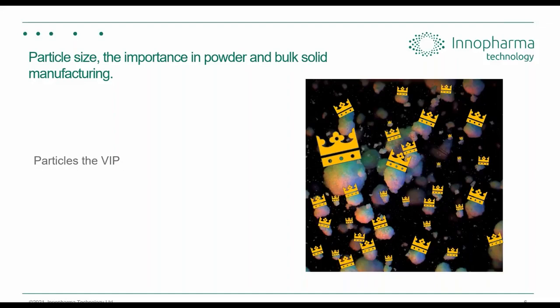Then second, actually, to, let's say, the end product for quality, another aspect of quality is the manufacturability of this product. So particle size affects things like flowability, blend uniformity, compactability. The link between particle size and product performance, again, is well documented. It's not what we're going to cover here today, but there are plenty of studies out there on how particle size affects things like dissolution, a study we've done ourselves, absorption rates, content uniformity, etc.